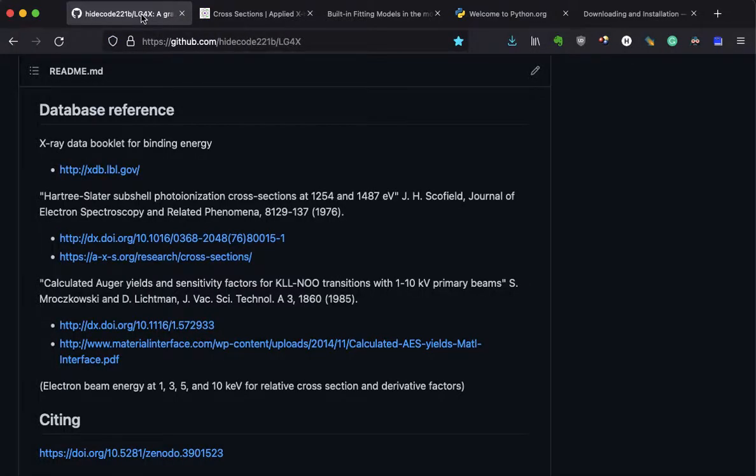So you can quantify the elements on your surface, or bulk in the case of hard X-ray photoemission spectroscopy. And sometimes Auger peaks appear, especially in soft X-ray XPS. Then you can also have the database available from here.